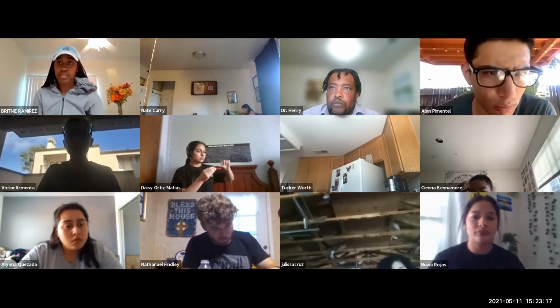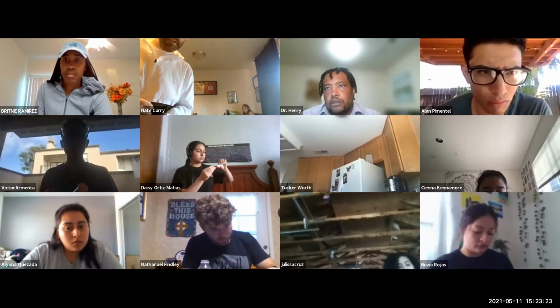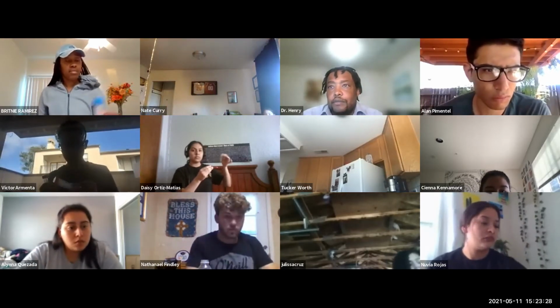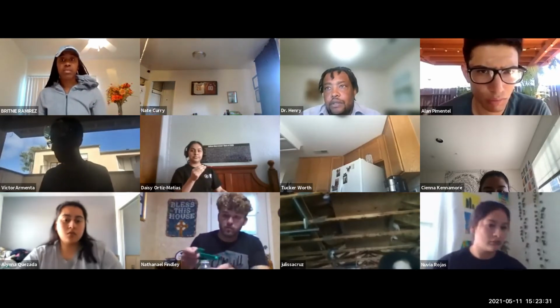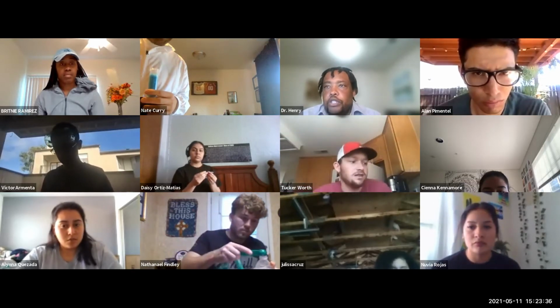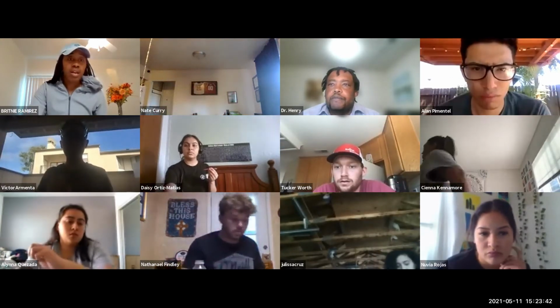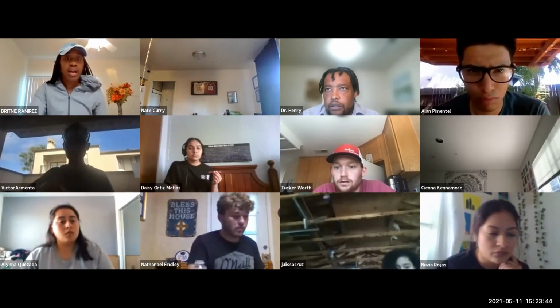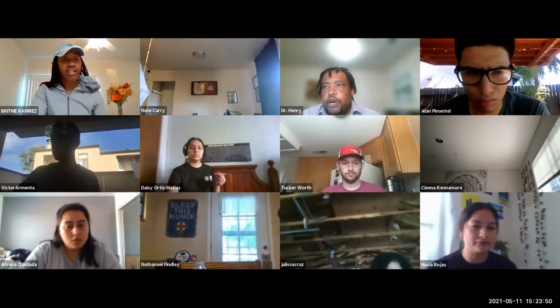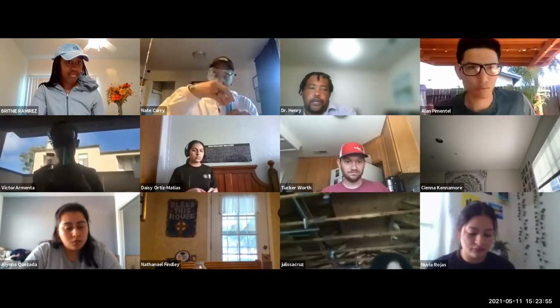All right, I only got one shot at this. Bring it up to 50 mil. That's all the way full, huh? We supposed to fill it to the top then? Yep. Okay. Is it distilled water or just faucet water? That's a good question. No, regular water is fine. Okay. We said we needed our distilled water. Oh, you will need your distilled water. So you're gonna use your distilled water for your cabbage.